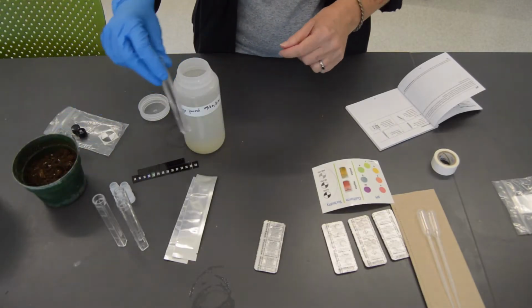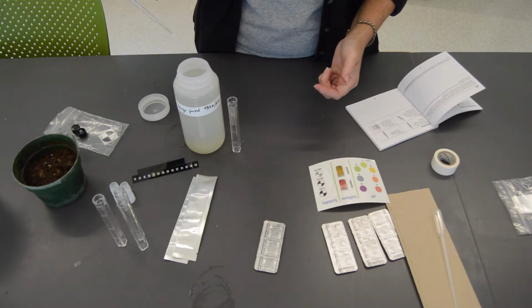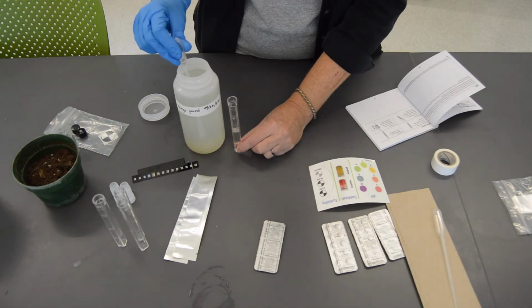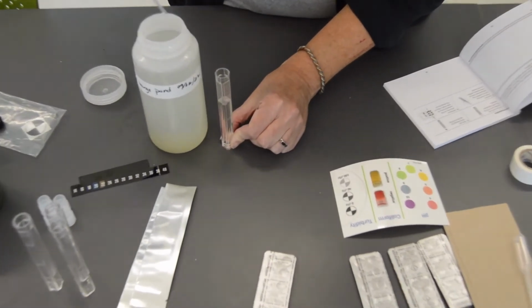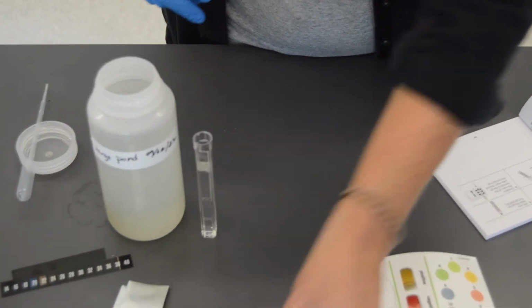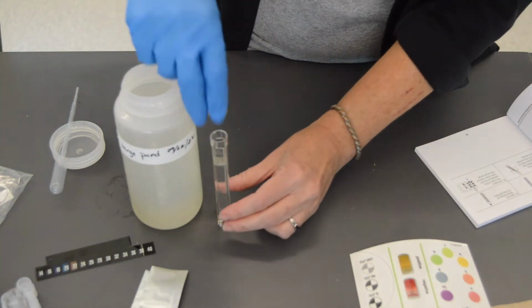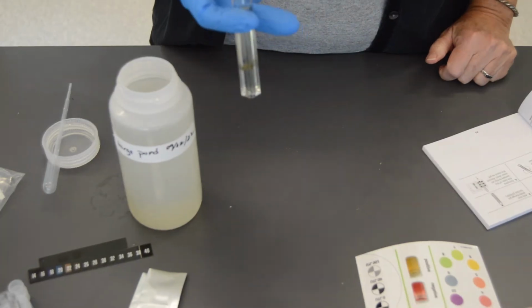So the first test we're going to run is a pH test. We just need to fill our test tube. You can pour it in if you're comfortable doing that, or you can use a pipette to make sure you've got enough solution in there. Of course, it might take a few. So make sure we have plenty of solution. And then we have our wide range pH test. So we can just take one of the tablets, drop it in. And then we're just going to invert until our tablet dissolves.